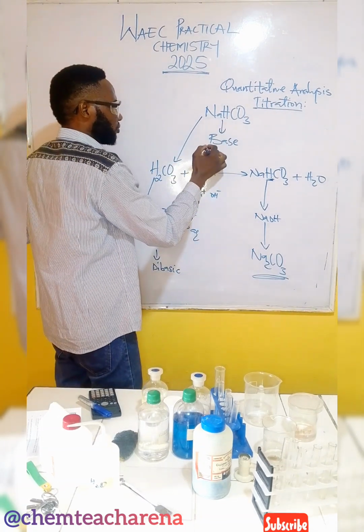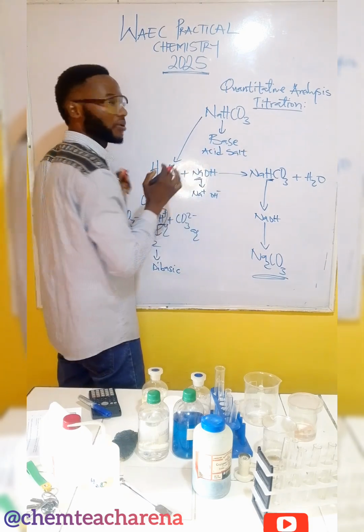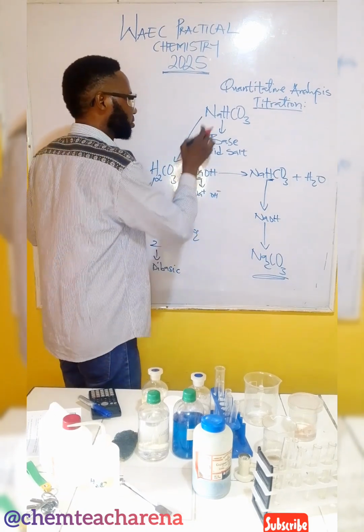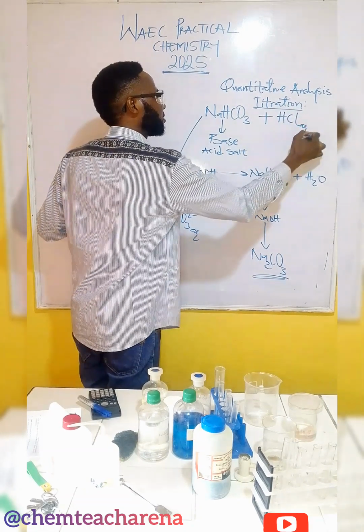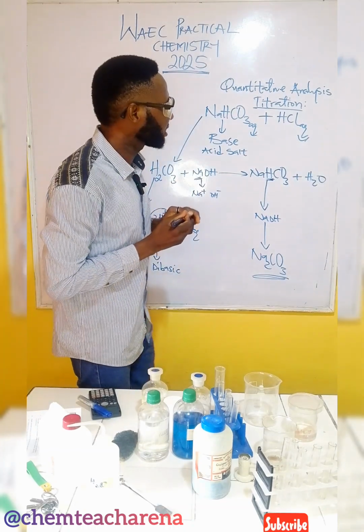Like I said, it's an acid salt. It's not a normal salt. You know, we have a basic salt, a normal salt, double salt, and all of that. But this particular one is an acid salt. Then the acid they gave to us is HCl, aqueous.